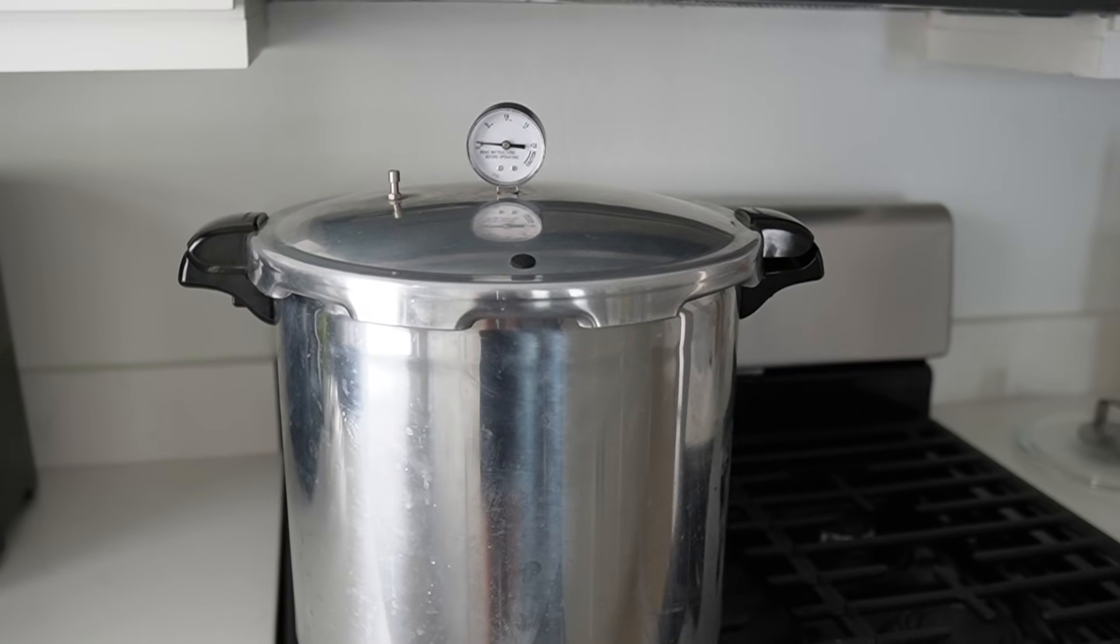I adjust the pH again to 5.7 and then I follow the steps outlined before to sterilize the multiplication media inside of the pressure cooker. Now you could attempt the next part of this video inside of a still air box. I am going to be using a flow hood.